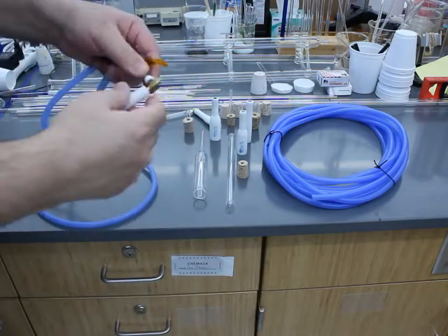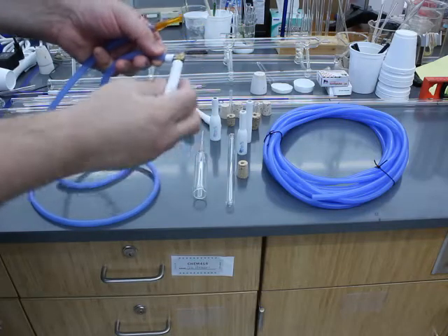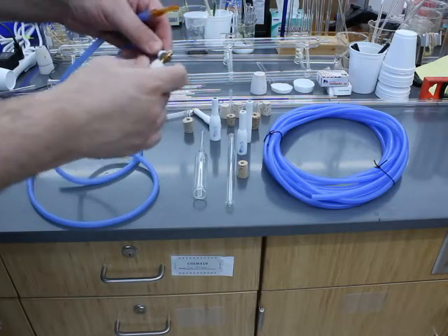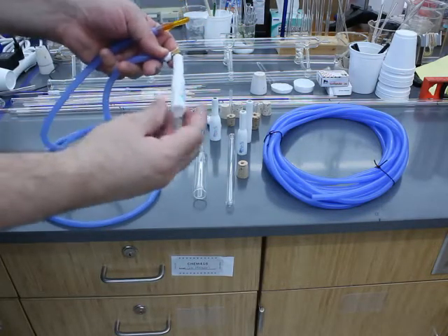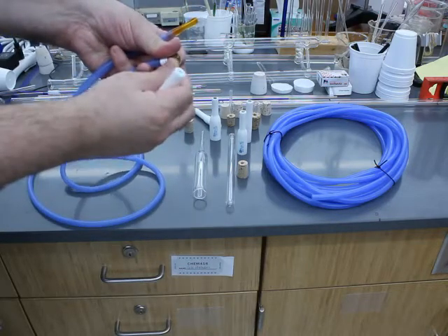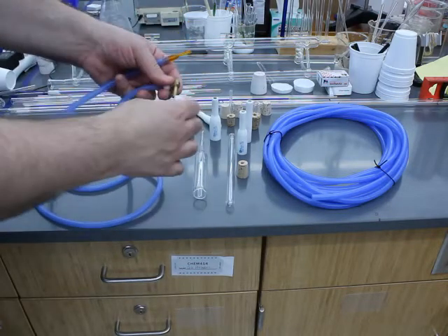And on the other end, you've got a swivel and adapter. This particular swivel, it only swivels in one axis. This is where we've got our adapter.